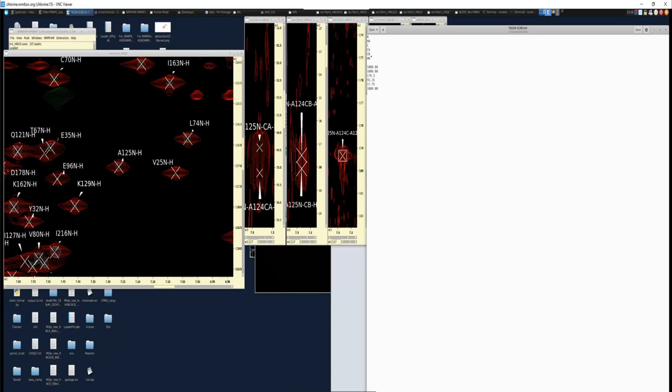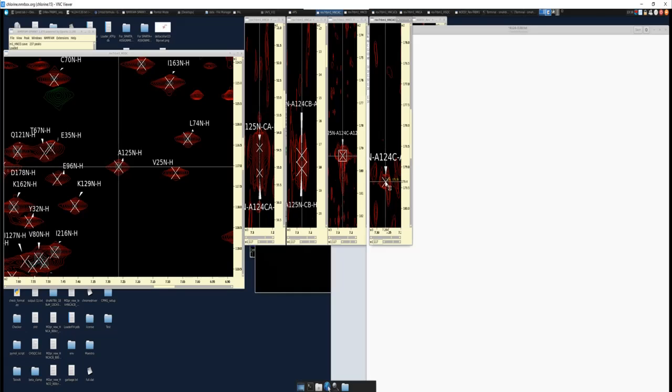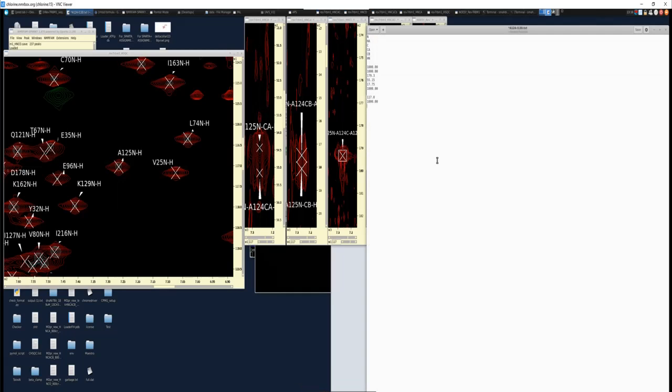Now we also contain information about the I. So let's put that in as well. So for that, we have the amide nitrogen, which is 117.0. We don't have H alphas here. We do have an I carbonyl. We do have the carbonyl value from the HNCACO. So that's 179.49.